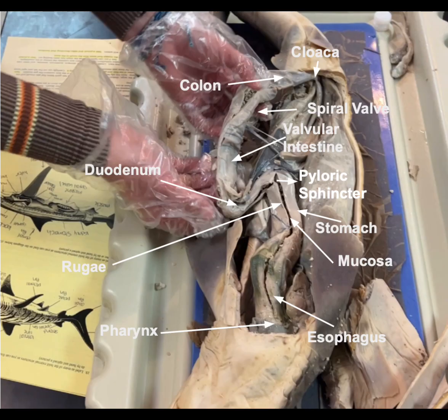The shark's stomach contains 3 important structures. The first is the mucosa, the stomach's inner lining, and then the rugae, are folds that churn and mix food with digestive juices. The pyloric sphincter is the third. It's found at the far end of the stomach and controls passage of partially digested food to the intestines.